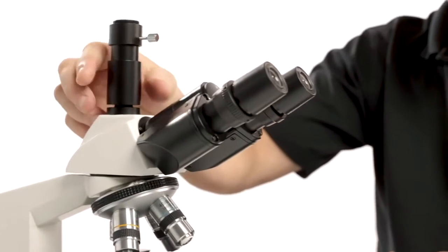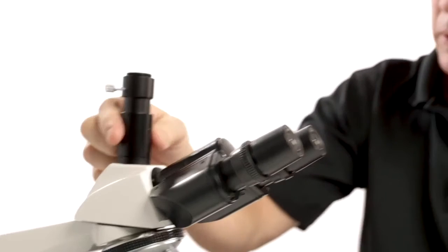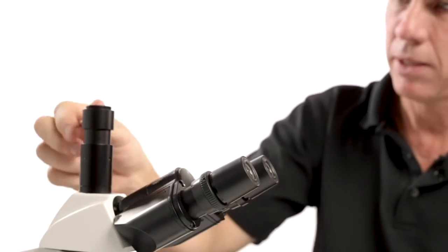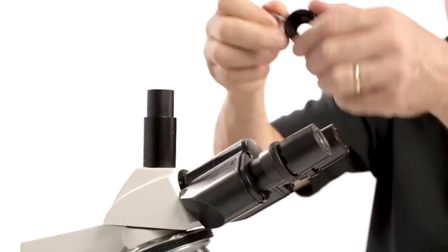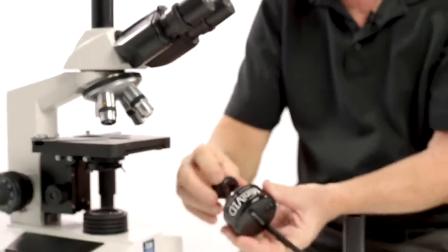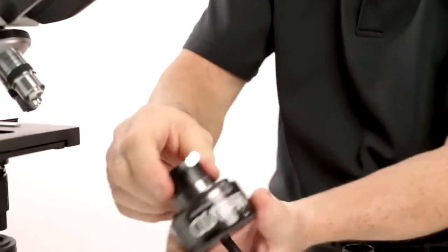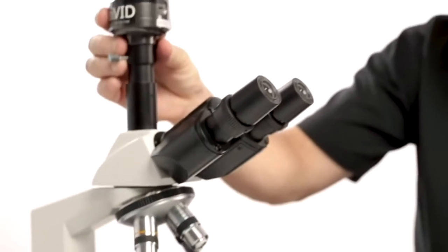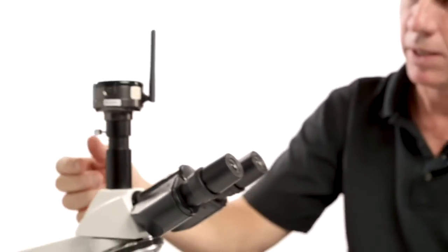So we're going to attach this pipe to the trinocular port. Threads on — that's tight. Notice I can remove the threaded C-mount here and put it onto the camera. We can thread this on, and it's pretty easy. This camera is now mounted, and we can tighten it up.